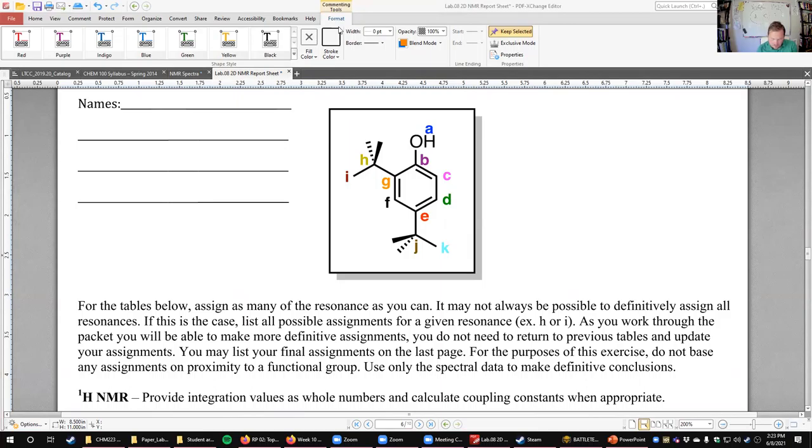So the lack of protons makes it a little tricky, right? But my initial thought is that if you look at the HMBC, looking at which ones should or should not show up is going to be the best choice. So both of these carbons, H and J, should both show up on F, but only J should show up on D. If you look at the proton associated here, you get 1, 2, 3 bonds. So carbon J could show up coupled with proton D.